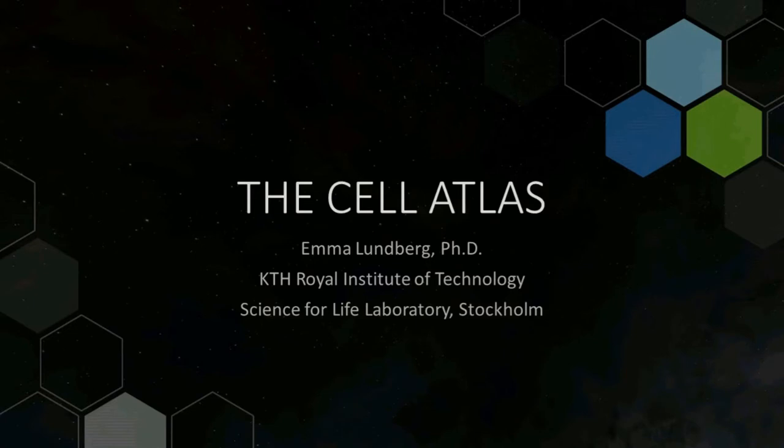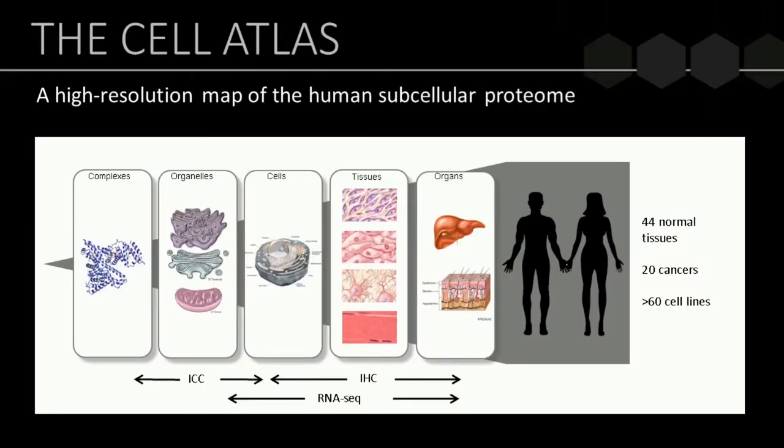Thank you. So I'm going to present to you the Cell Atlas that was launched in December, the end of last year. And this is work that is being done as part of the Human Protein Atlas project, and we are creating a high-resolution map of the subcellular human proteome.